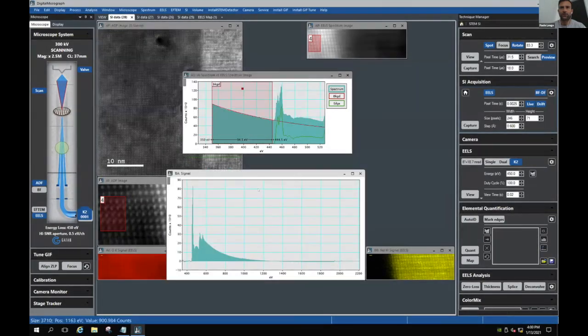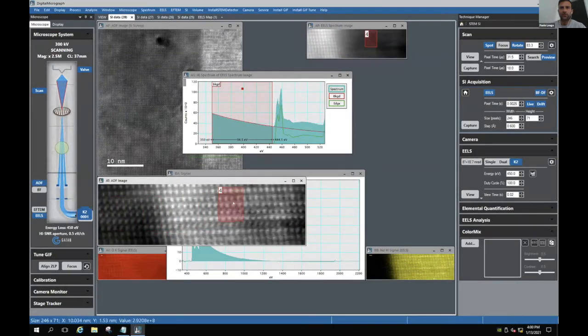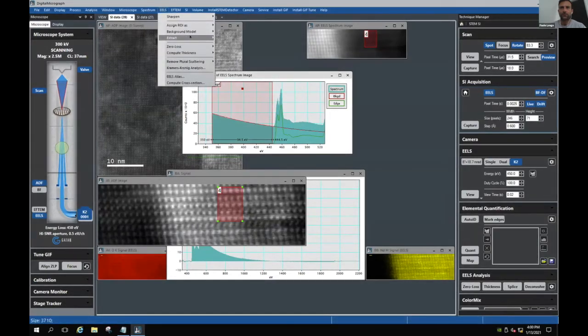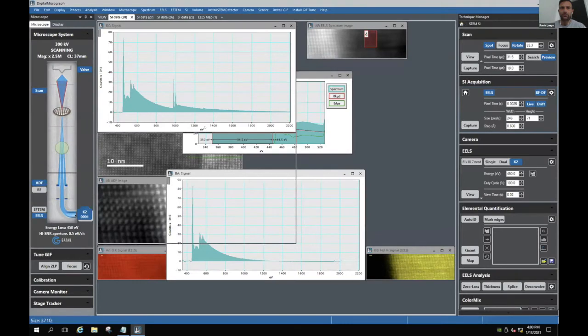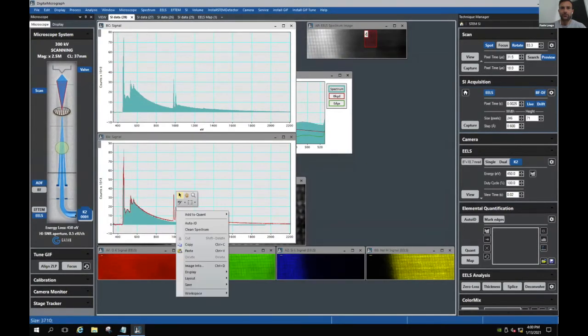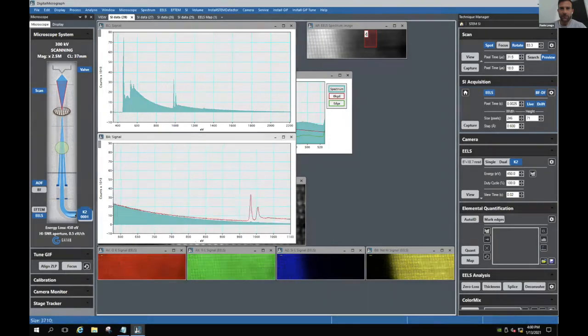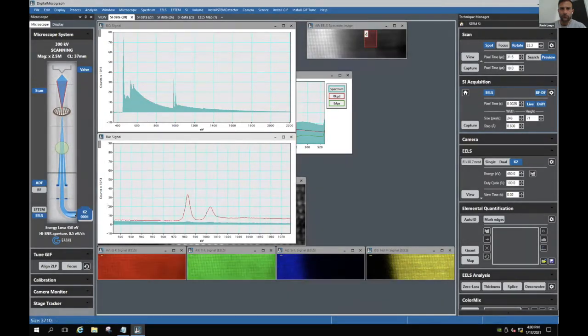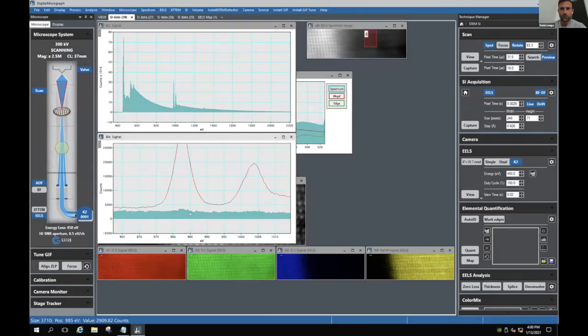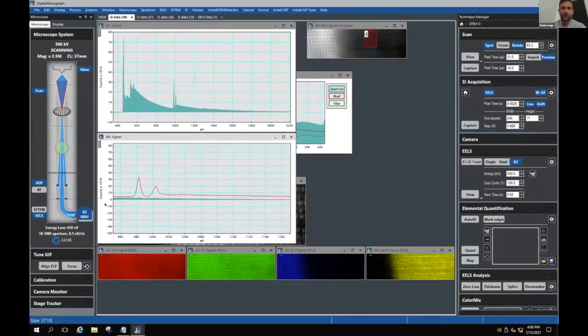This is one spectrum from the STO. Then we go into the other one. Just to give you a quick example. So we're doing here. And then you extract a spectrum there. Okay, so we have these two spectra. Let's compare. The interesting thing is that we actually see a little bit of neodymium even inside the STO. And again, this is because of direct detection and you're very sensitive to traces. It would be nice to test with the other detector as well.